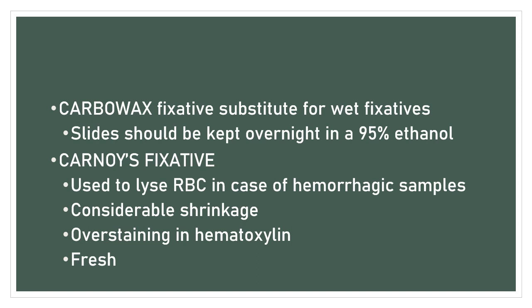And so you have here your carbowax, or polyethylene glycol, which is a substitute for your wet fixatives. Okay, and so before staining, when you use carbowax as a fixative, your slides should be kept overnight in 95% ethanol.